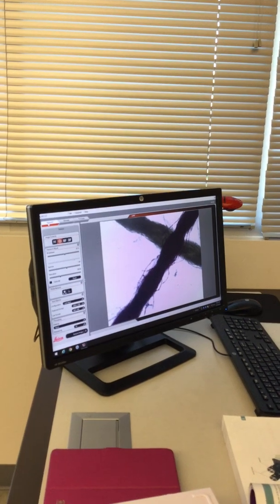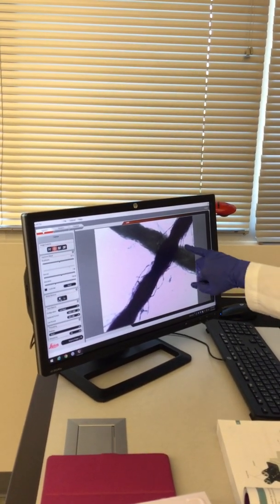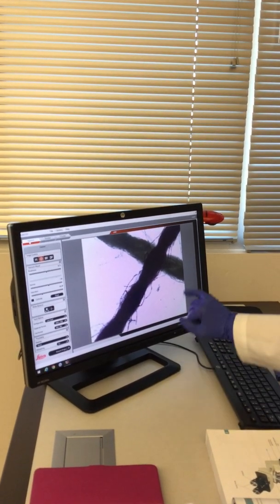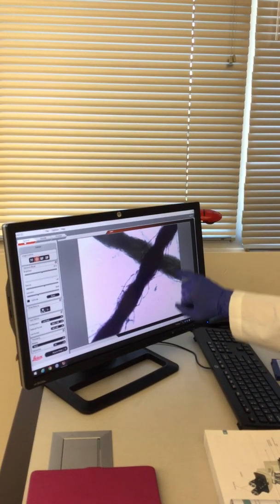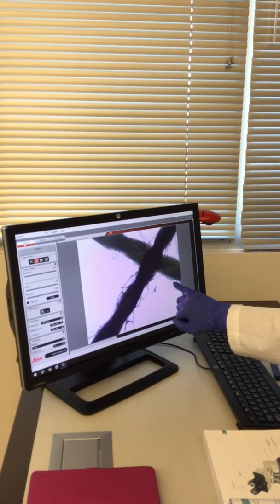That's what you can do. Like in here, I move it a little bit out, so I'm trying to see better these little threads, or mini threads, out of this red one. And what if I want to focus on this edge? So I move it, and then you lose the definition of these two, but you see better this edge.